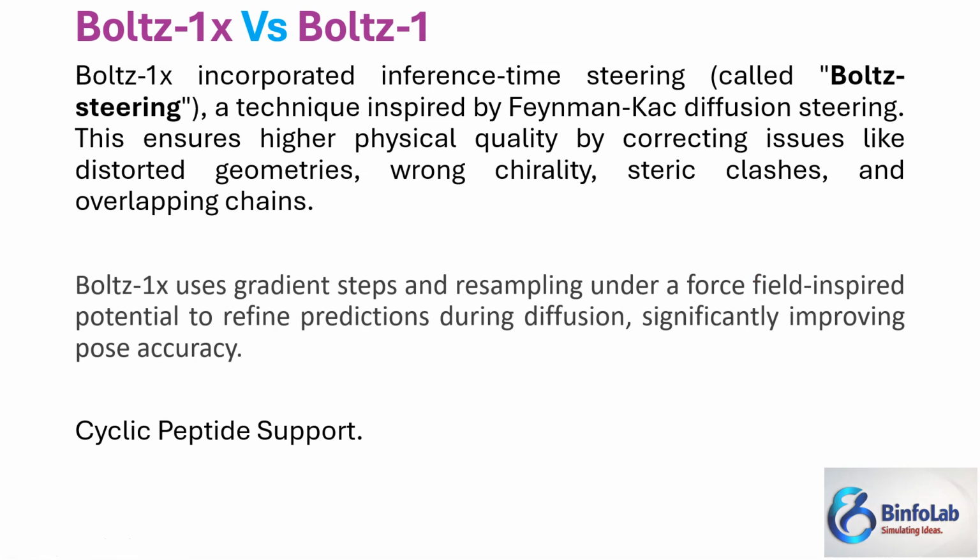So using the information from the force field, the program will gradually filter out and bring you the best model, and that's why it will increase pose accuracy between different chains. The chains could be DNA, compounds or proteins.